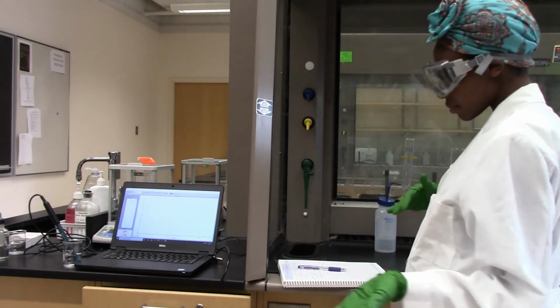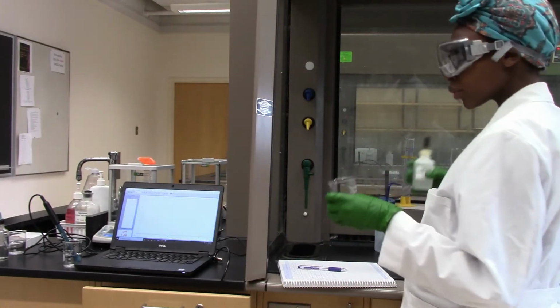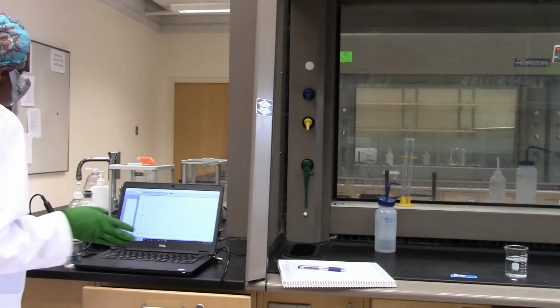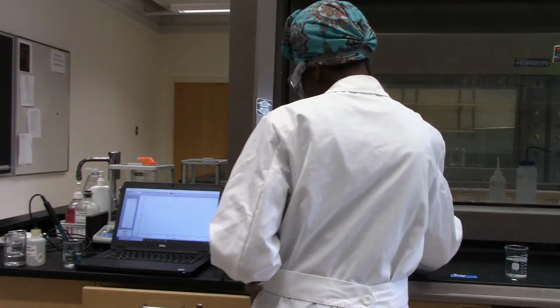Now I'll do the same thing with sodium hydroxide, where I take my pure deionized water, I add 1 drop, then 2 drops, then 5 drops, and finally a full dropper, and see the change in the pH reading.